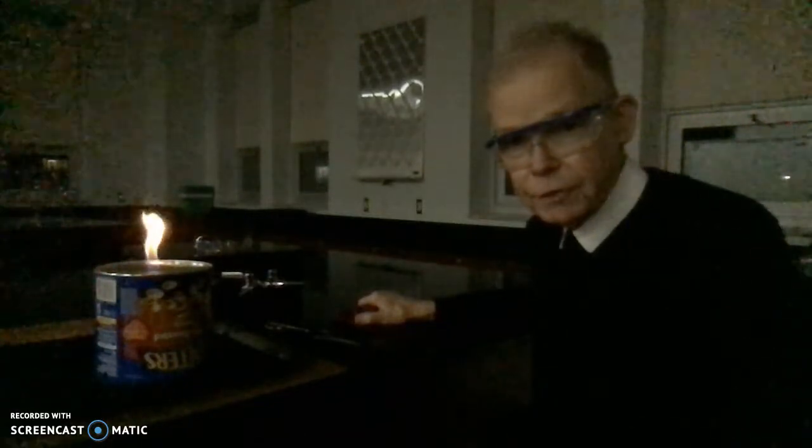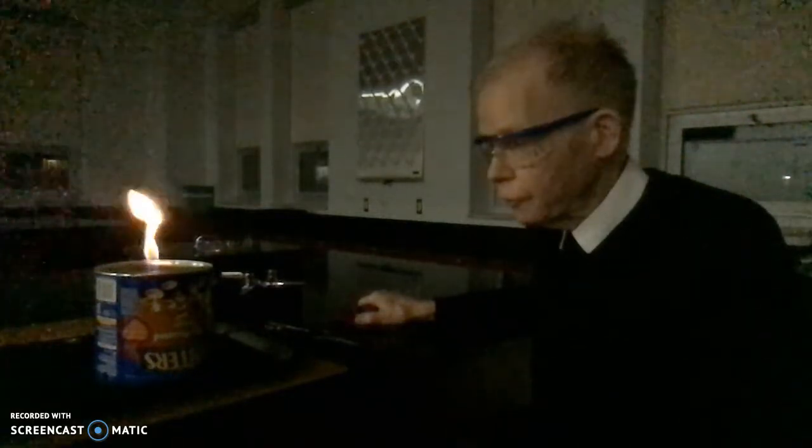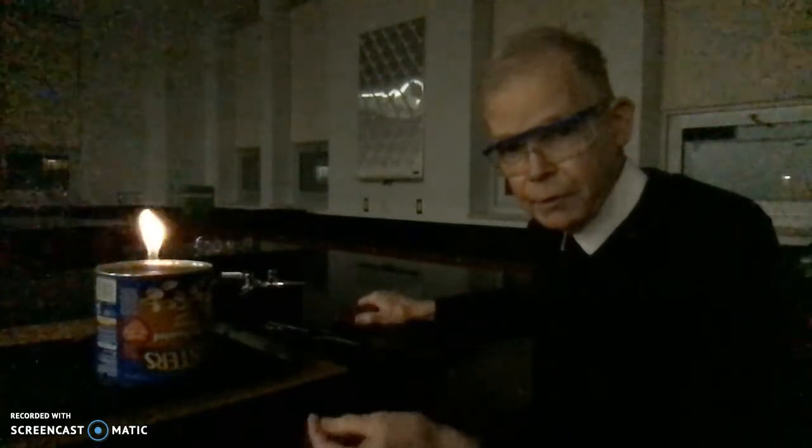As I mentioned in the first video of these three types of reaction, as the fire proceeds, a little bit of air is coming in at the bottom of the can, so the can is now starting to fill up with a mixture of air, which has oxygen in it, and also the methane.